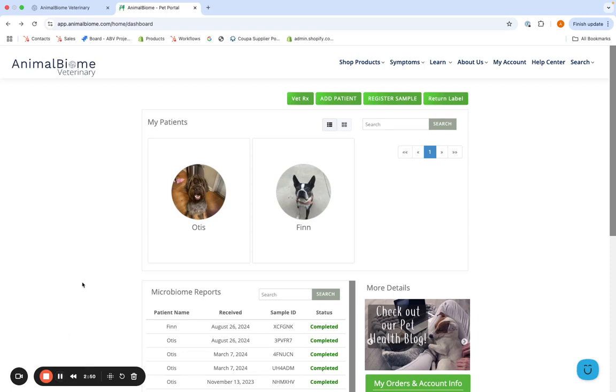Now, the first method that I showed you is great for those bulk test kits that you may be purchasing for your practice. So anytime that you are sending in a sample directly from the clinic, whether it be that you're collecting it there at the practice or they are bringing a sample in for you to send in, that method is the preferred method.